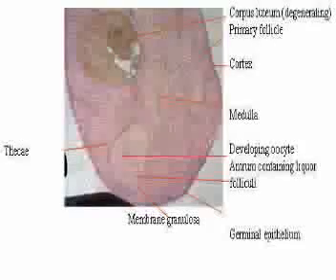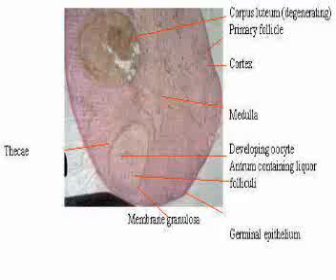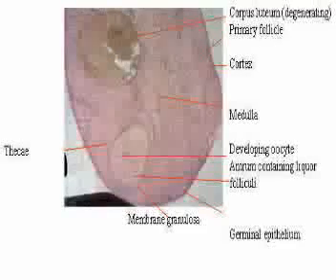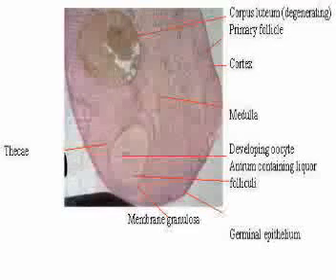Differential diagnosis. The ovary can easily be confused with other structures, especially those that have follicles. But the follicles of the ovary are usually in varying sizes as opposed to the same size of the follicles in the thyroid gland.